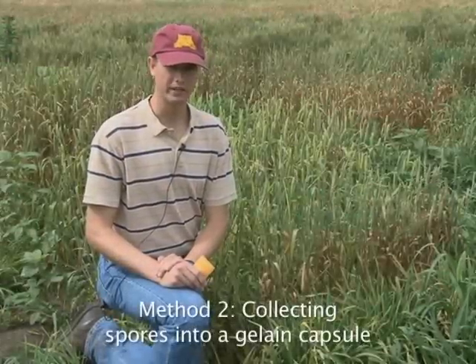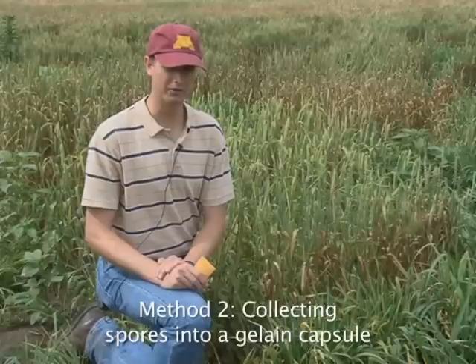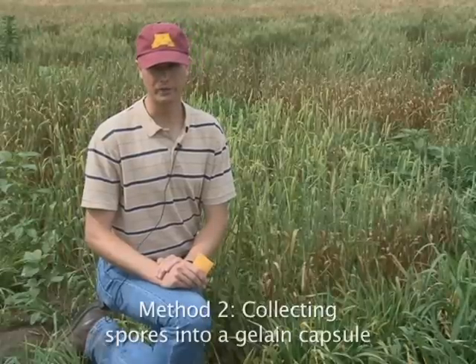The second method for collecting stem rust from the field is to collect rust into gelatin capsules. It's important to know that when you're working with gelatin capsules, these can start to degenerate if they get too wet or if it's too humid outside. So collecting rust with gelatin capsules is only really practical if you're very close to your greenhouse or lab.